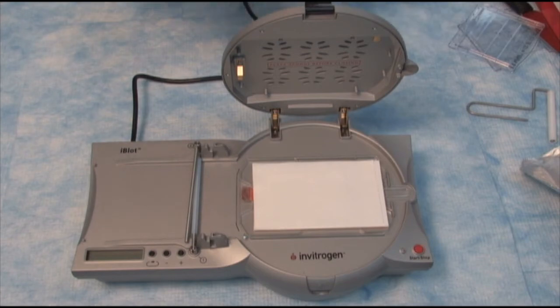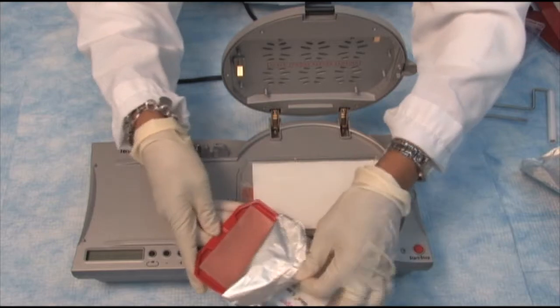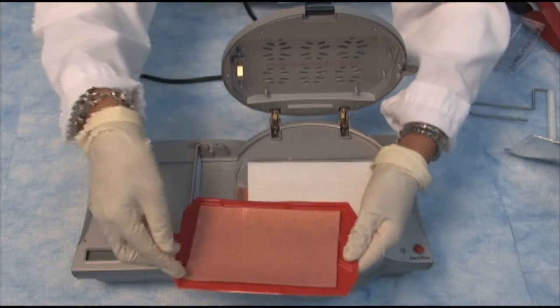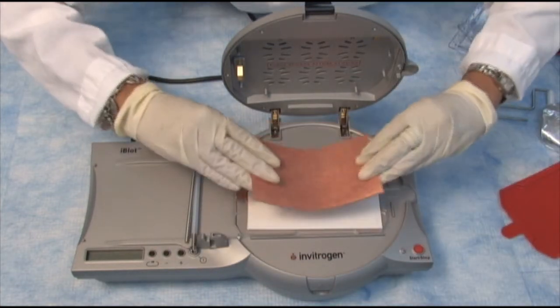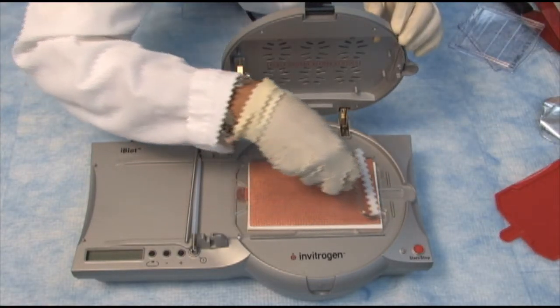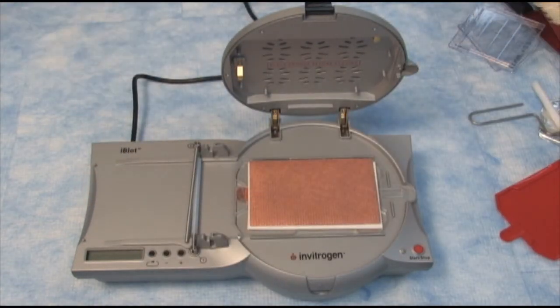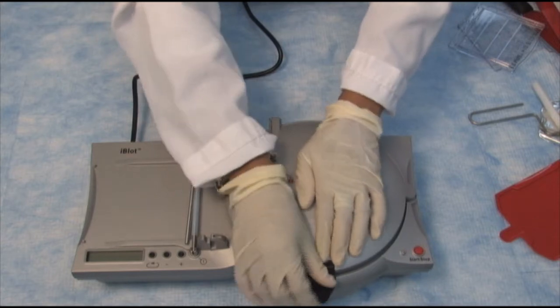We now get the top stack. This time I'm not only going to remove the aluminum foil, but I'm going to scoop out the stack from the tray and place it on top of the filter paper. Once again, remove any air bubbles. Then take one of the sponges that comes in the kit and place the sponge in the lid, and simply close the lid.